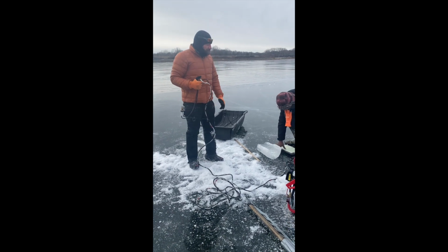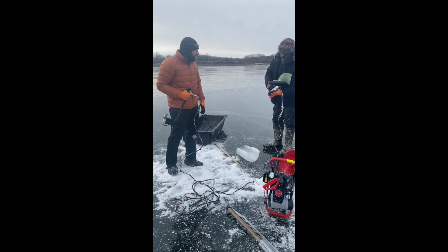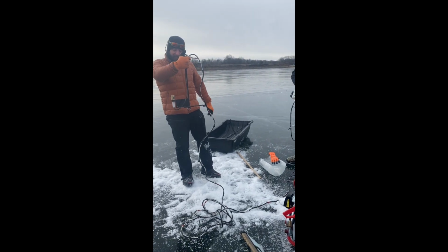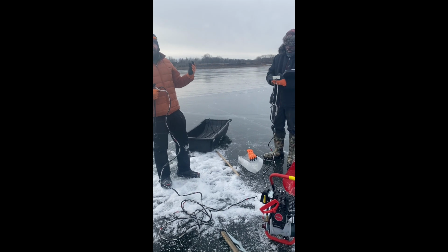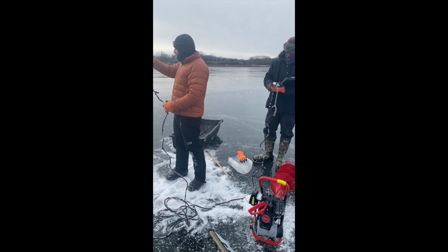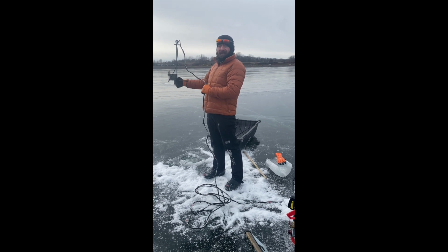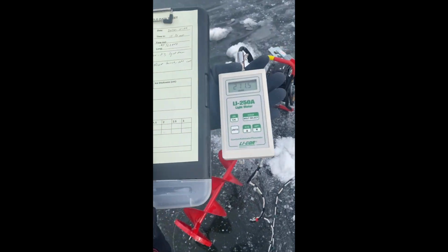Okay, so we're ready to do our light profile. So we have a LI-250 light meter connected to an LI-192A flat quantum light sensor, and what we're going to do is make a few measurements. So our first measurement is going to be in the air, and we have an averaging function on our light meter which we use for getting average values. So we're just going to hold it flat, making sure we're not shading it, and collect an air measurement. 211.5.